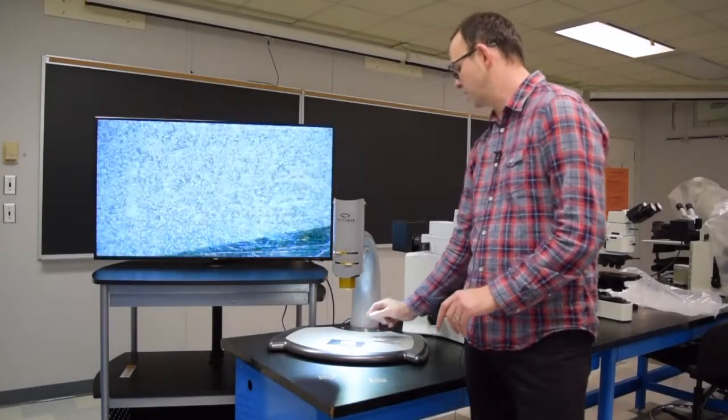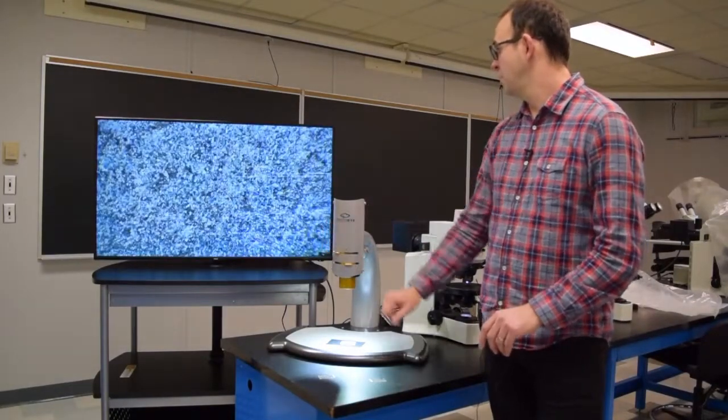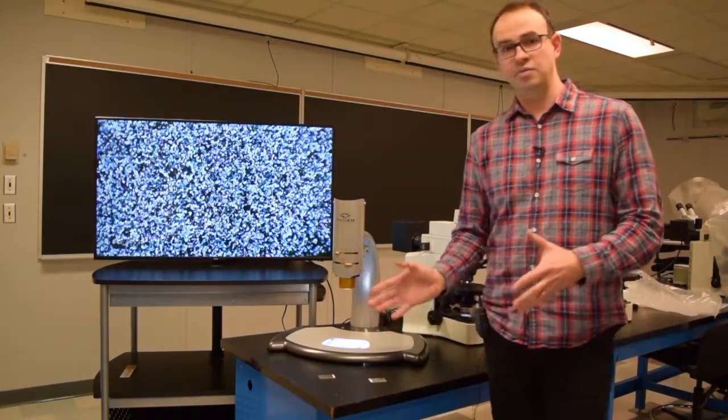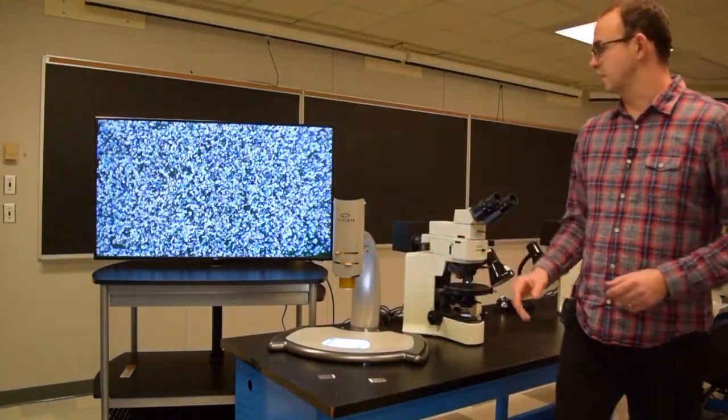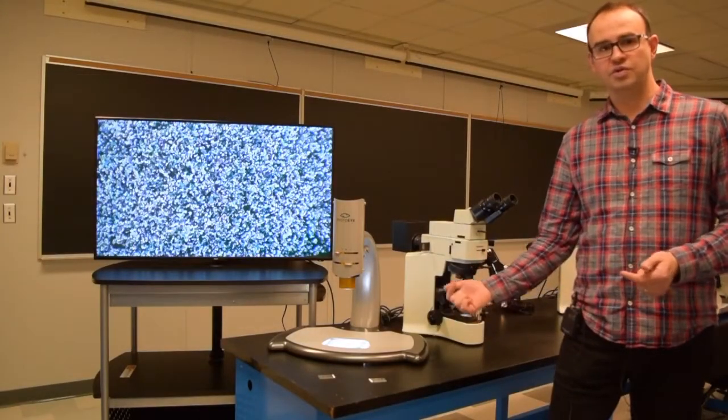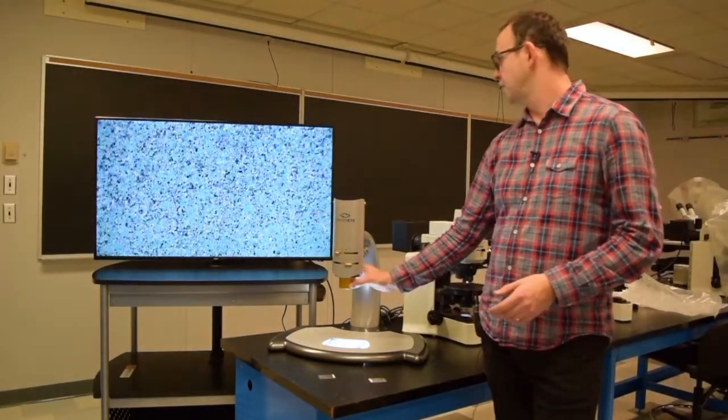It's high magnification, and we can zoom in and see the grains. We can also make them appear in interference colors, the so-called cross-polarized view, where light goes through the thin section and through two polarizers that can be crossed at different angles.